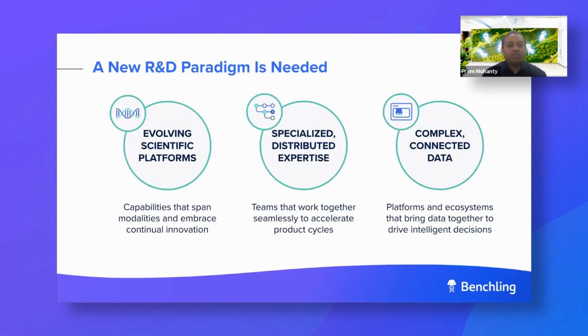As science becomes more complex, we are seeing teams become much more specialized to increase the depth and efficiency they can bring to each step in the R&D process. Each of these teams is producing not just more data, but more complex data. There are more contextualizations that need to be maintained as you move downstream in the process and across programs. There are more streams of data, from lab automation and analytical instruments to experiments being done by lab scientists. So the industry is looking towards digital solutions here to not just manage the volumes of data, but to bring order and structure to it.